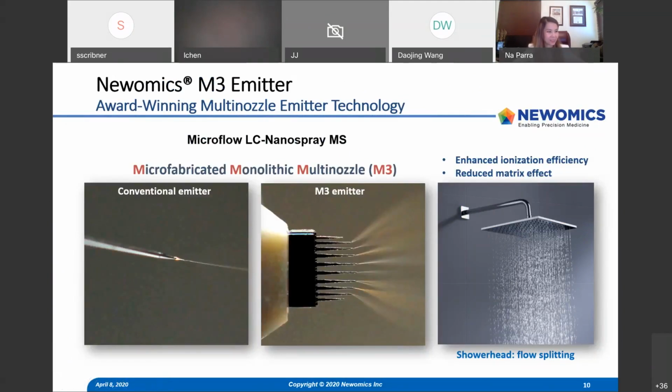Okay. So good observation. It actually took us 3 years to finalize this design. If you look at these 10 nozzles, you probably realize the first one and number 10 don't spray because we deliberately blocked them. The internal 8, we made hyperbolic. This design was based on a lot of modeling, electric field modeling, as well as testing, alpha testing, beta testing.